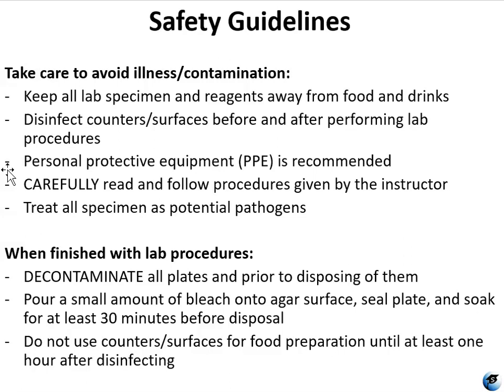If you have access to PPE, I highly recommend using PPE, especially when you're working with any live specimen like your yeast culture or your Ubiquity plate. Be sure to carefully read and follow the lab procedures that are provided. Treat all specimen as potential pathogens. Make sure you decontaminate your plates and broths and all of that stuff before you dispose of them. And don't use your counters or surfaces for preparing food for at least an hour after you've decontaminated it.